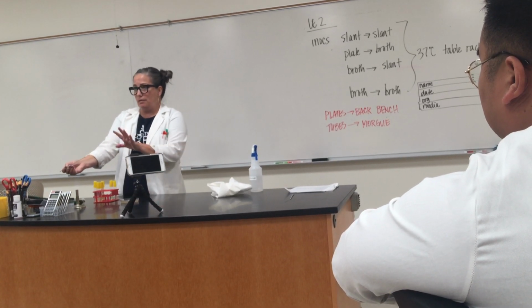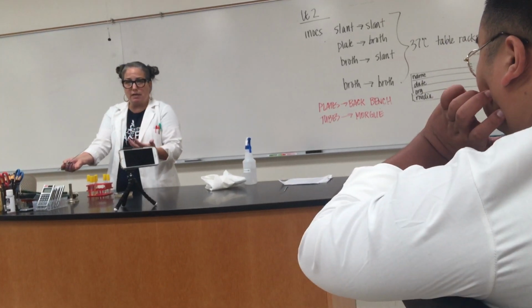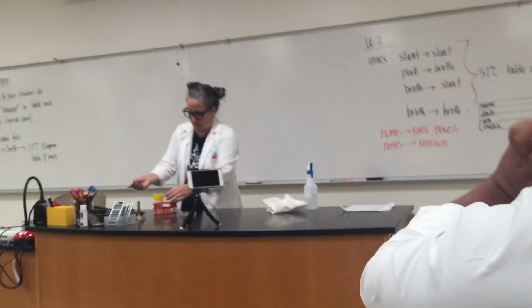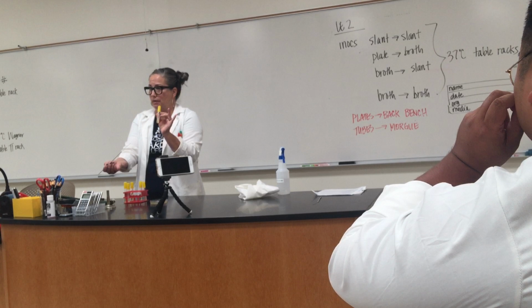And now it's sterile. The longer it sits outside that flame, the more likely it is to be contaminated. So we want aseptic transfers to be as quick as is safe. So if I'm doing the first one, slant to slant, I will grab my E. coli slant. This is a one-person job. It's awkward. You need to get used to it.